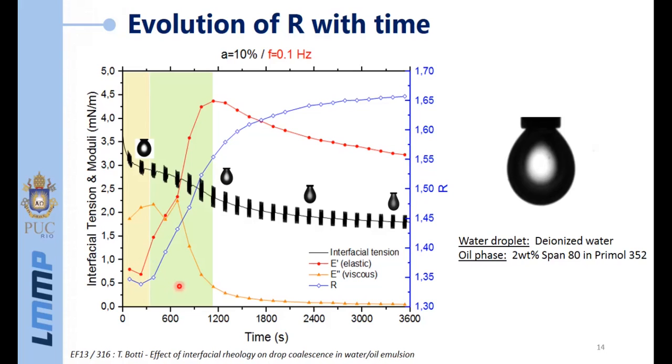Slightly appears at the interface, the viscous modulus decreases while the elastic modulus increases. Little by little, the structure avoids the transfer between the bulk and the interface. This appearance leads to an increase of the volume-area ratio from 1.35 to 1.6. This zone ends with a maximum of the elastic modulus, while the viscous modulus is quasi equal to 0.